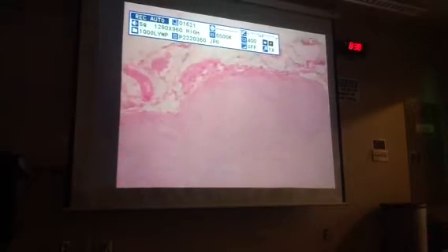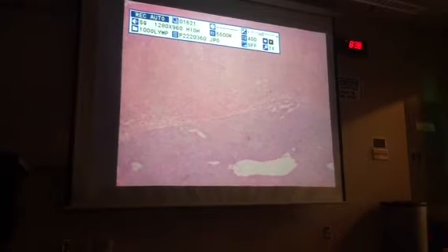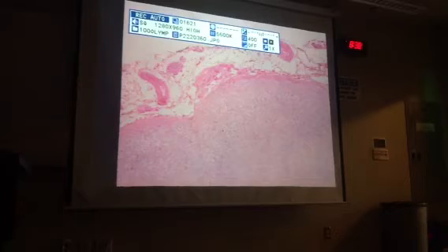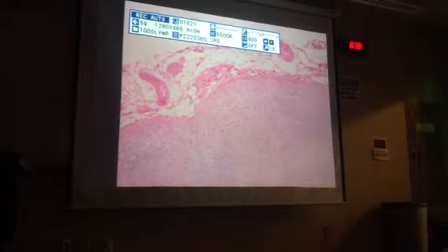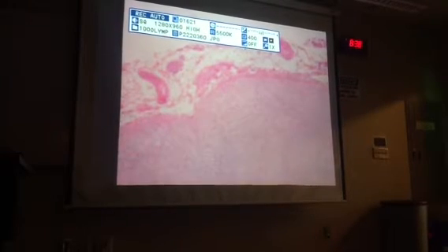And I think it's harder just because it's challenging to see the different cell types, particularly magnifying them like this. You lose a lot of the definition that you can see with your microscope.